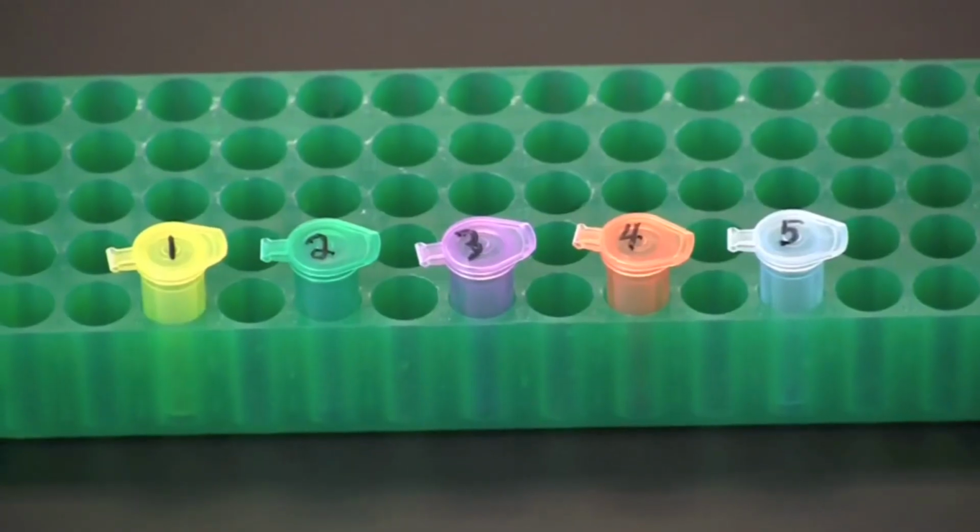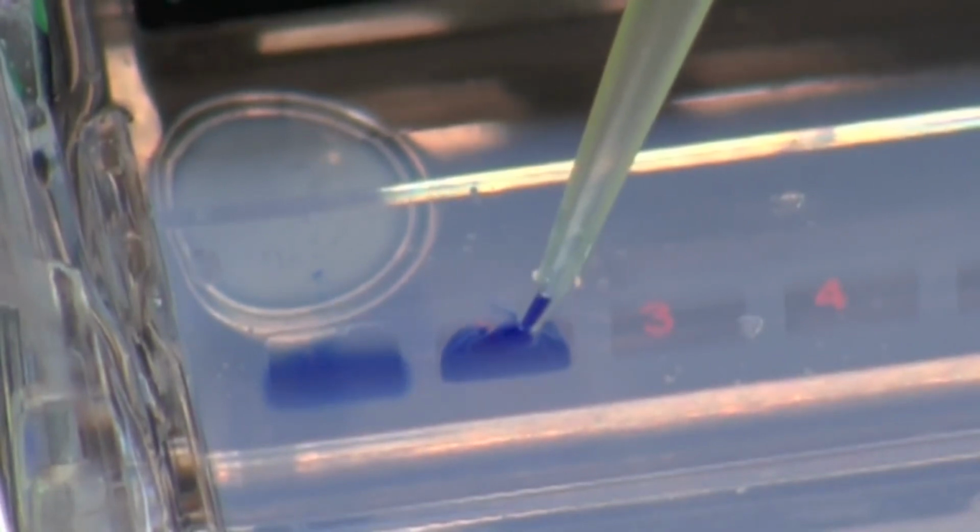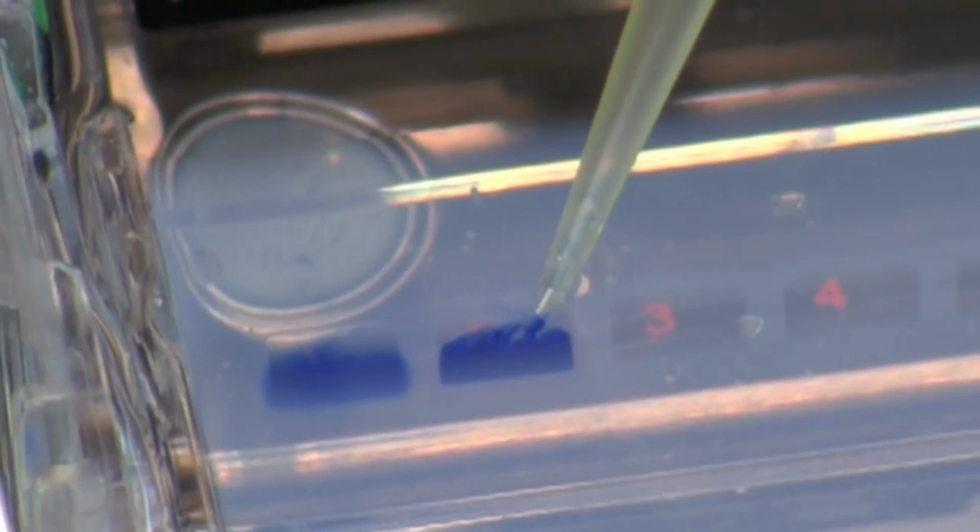It's important to place your samples in the correct order according to the lanes or wells that they are assigned to be running in. When loading samples, it is important to keep the pipette tip perpendicular to the row of the wells. This helps prevent it from breaking through the bottom. It is important to make sure that you get all of your sample into the well. Otherwise, it will leak and not be able to run correctly.